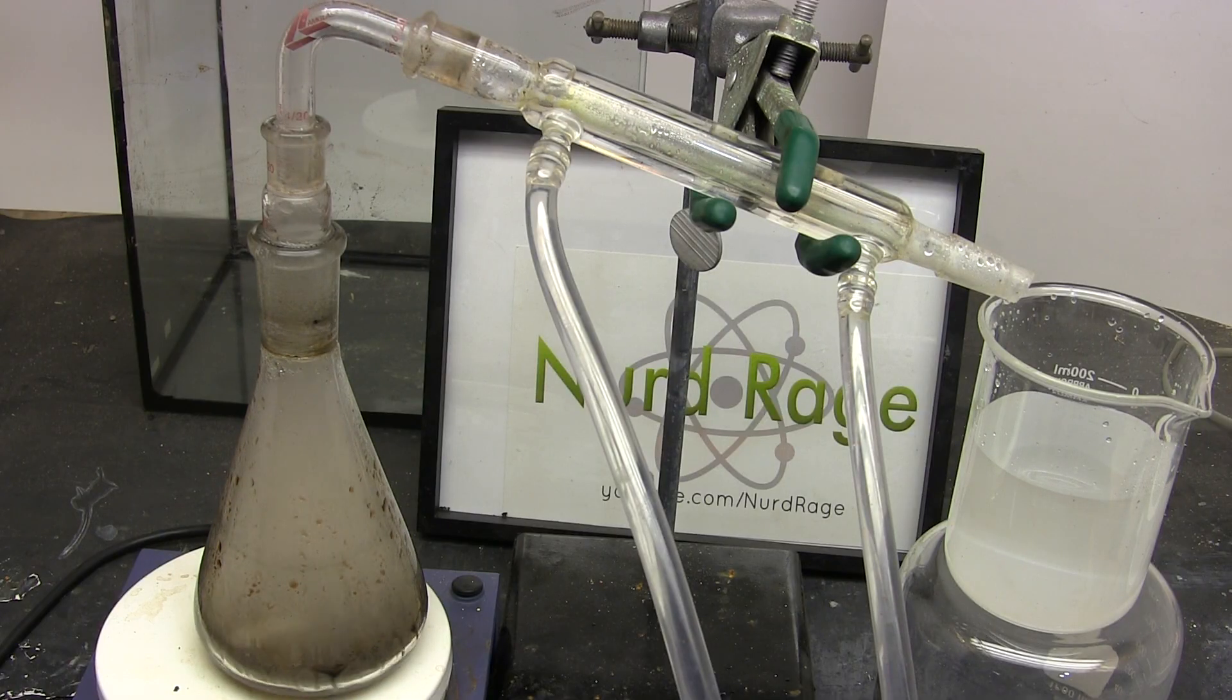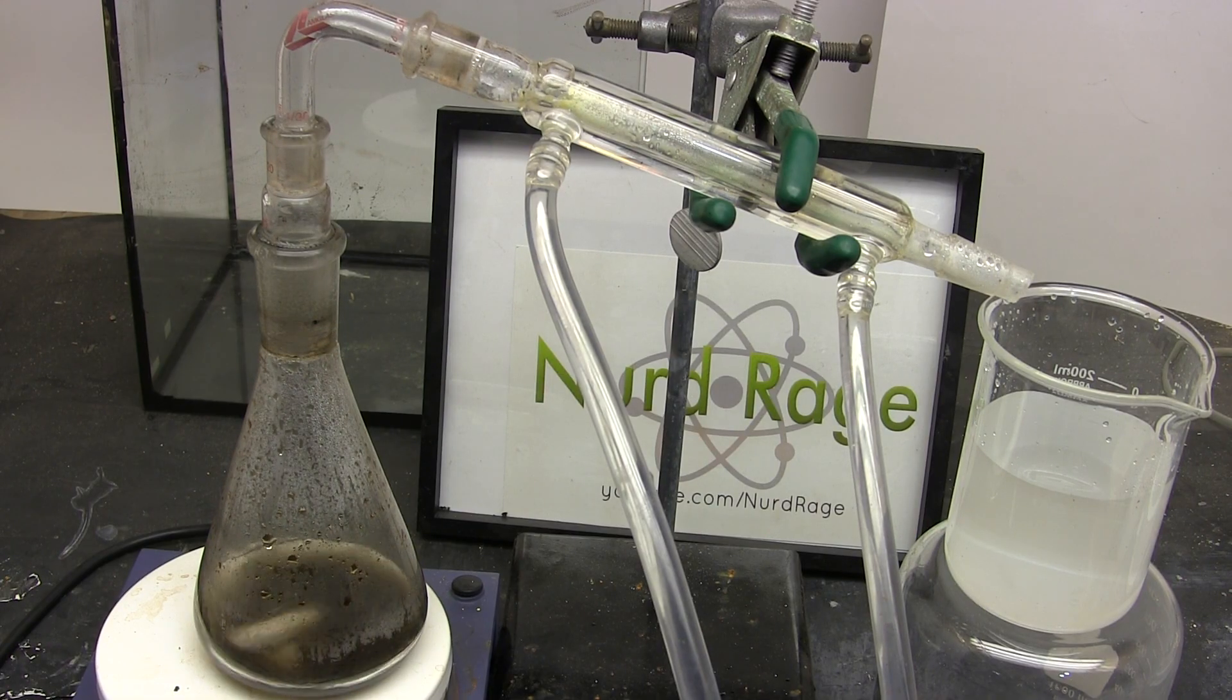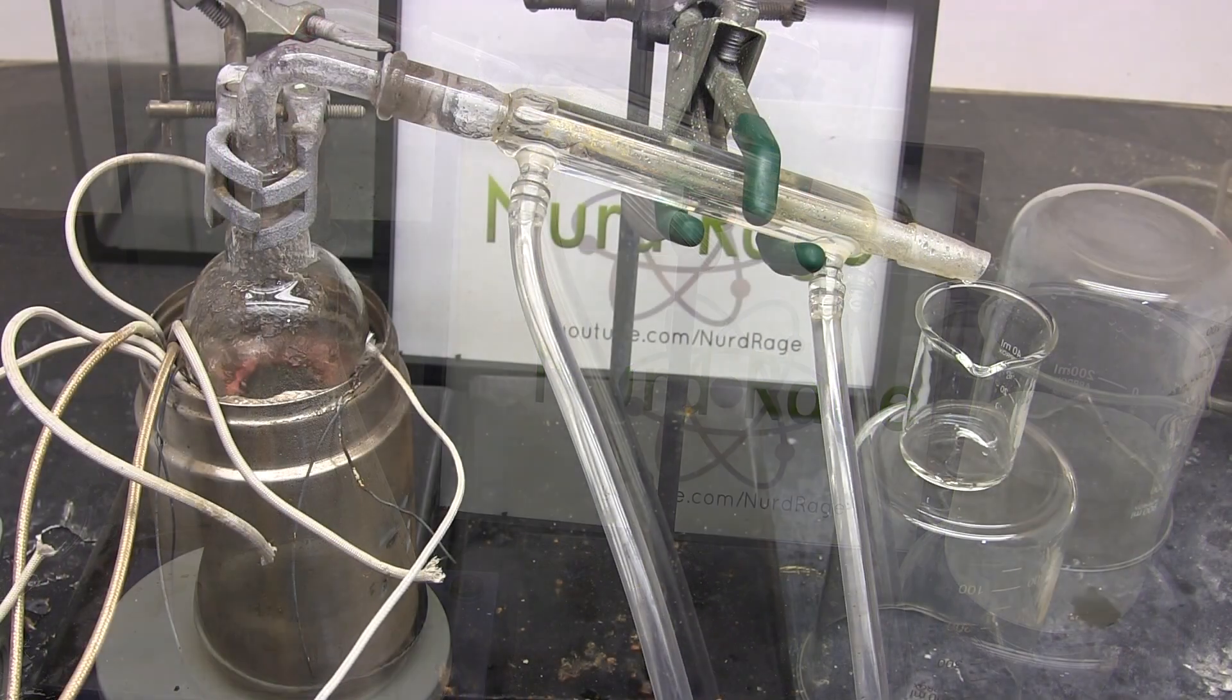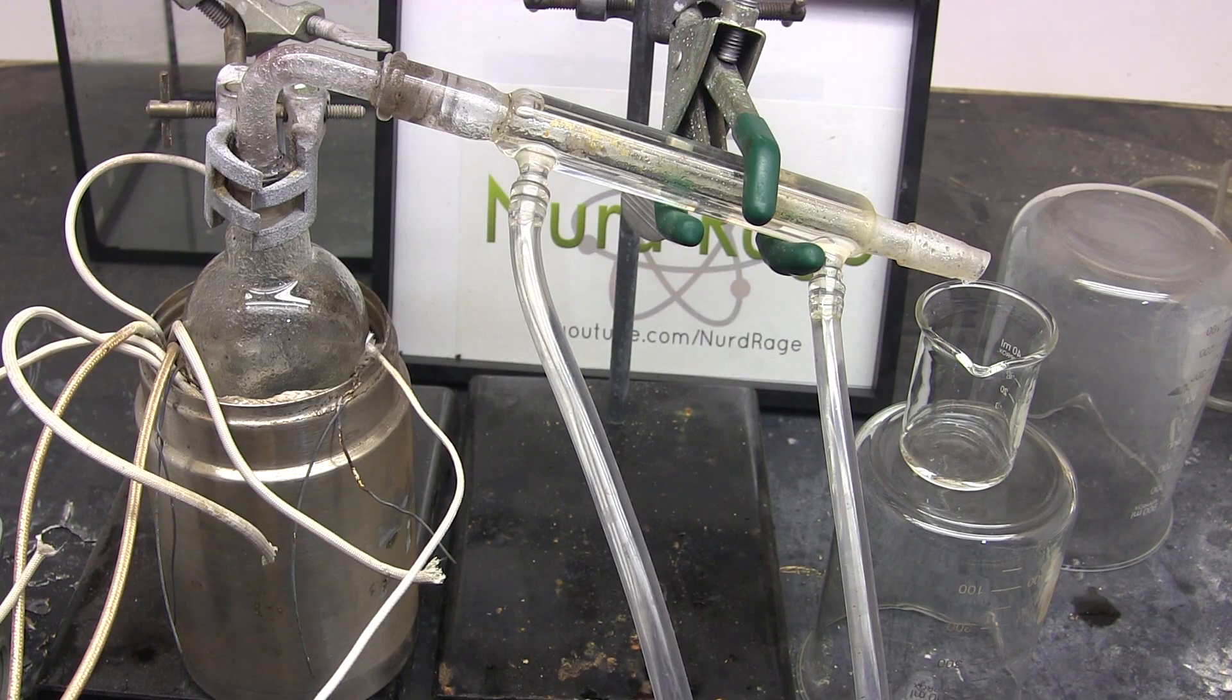Keep distilling on until you get this misting occurring in the flask. Turn off the heating and let it cool. The residue in the flask is a weak and dirty solution of sulfuric acid. To purify it we use the process involving the high temperature heating mantle I showed in an earlier video. I'll let you take a look at that one yourself so you don't waste your time here.